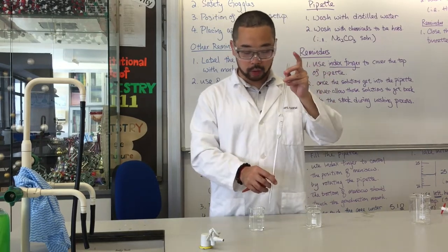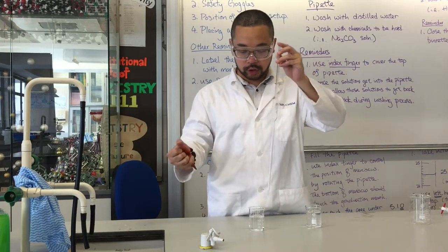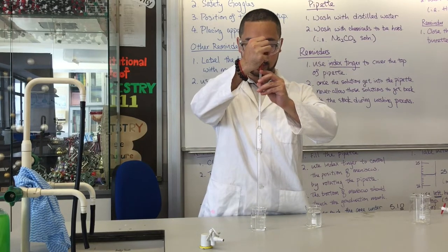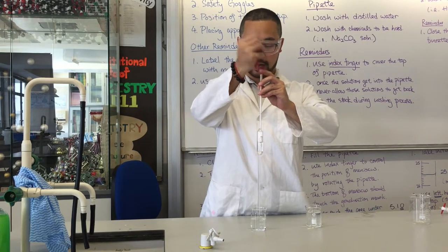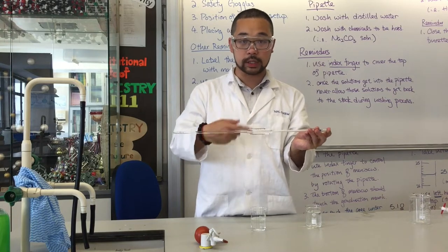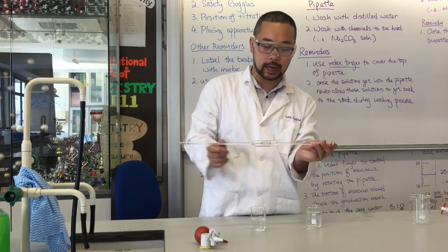So first of all, it will be the water. Remember, you should use your index finger to cover the top to hold the solutions. So right now, we put the pipette into the beaker, and then we use water to wash it first. After the liquid goes up to half bulb, you can control it, hold it up, and make it horizontal. Now we will rotate the pipette to rinse the inner part of the pipette. You may also want to wash the top part of the pipette like this as well.